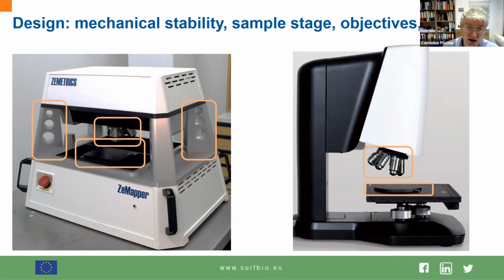At least for the higher magnification objectives, you have to correct for that if you change from white light to monochromatic light. With green light, it is okay because it's in the central part of the emission spectrum of white light. If you're working with blue light to enhance the spatial resolution, you have to correct for the reference mirror position if you are switching back and forth in between the two measurement modes.